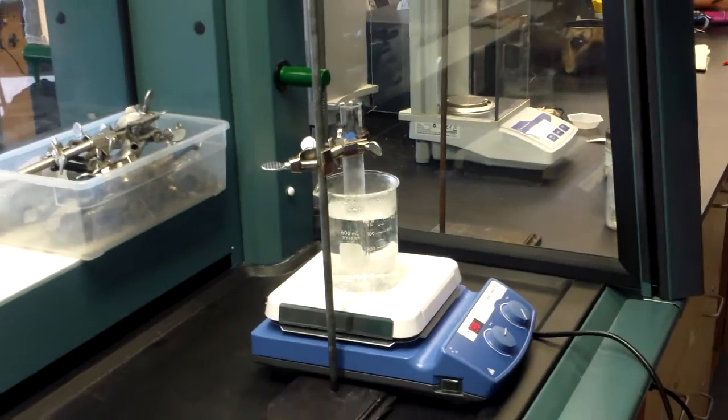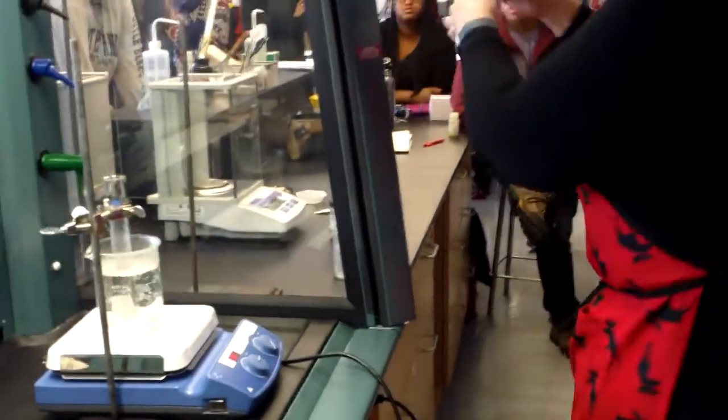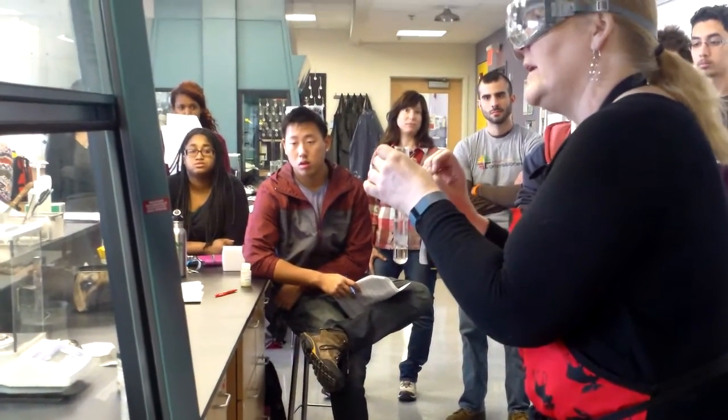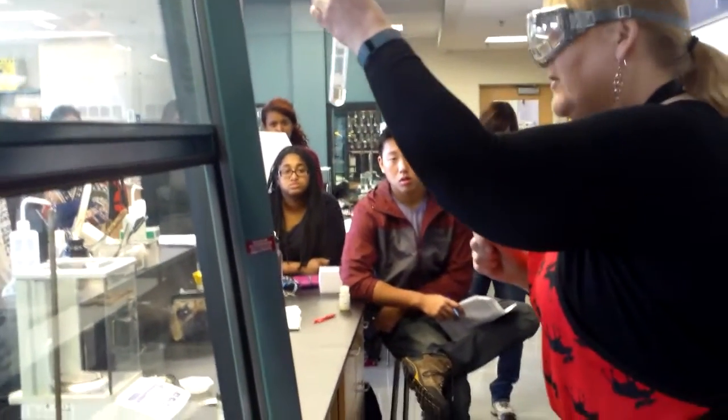So you'll heat up your naphthalene sample. Once your naphthalene sample is nice and hot, and by hot, it needs to get to about 90 to 95 degrees. It needs to get well above the melting point. Otherwise, you will not get enough points going down on your curve. So, you get a nice hot sample of naphthalene.